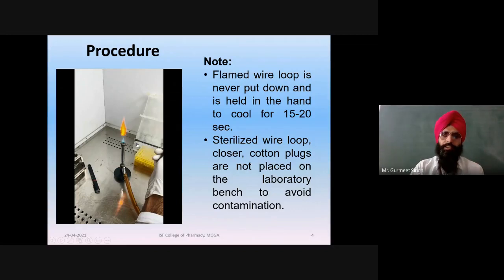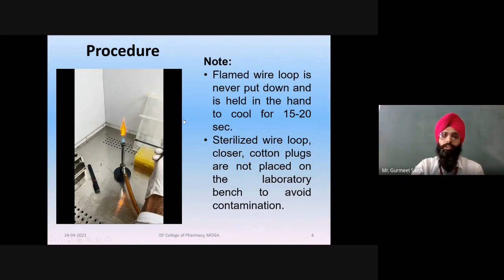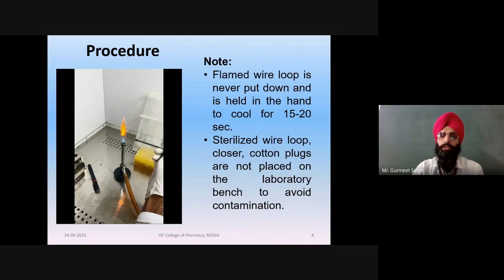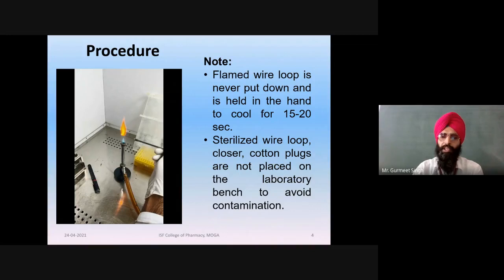After that, the subculture tube is transferred into the incubator. Lastly, note some important points: the wire loop is never put down — hold it in the hand to cool for 15 to 20 seconds. Also, sterilized wire loop closures are not placed on the laboratory bench to avoid contamination.